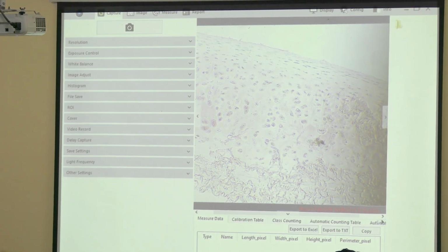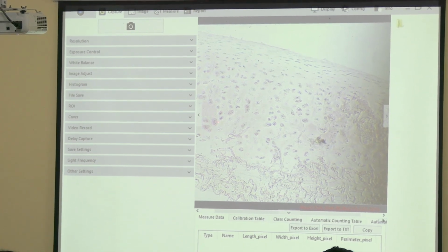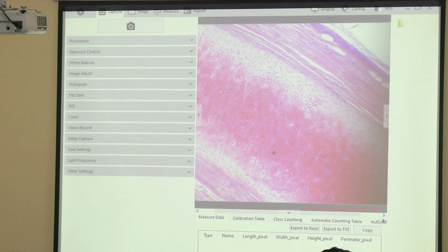And at the central position, you see the population of cells is more and bigger than at the periphery. Here you see the cells are bigger and the population is more than the periphery, right? And the intercellular substance is transparent. Here it is not actually bluish in color, but in a good slide you will get bluish color. The intercellular substance will take hematoxylin stain, that is bluish in color, right? Here you see the cartilage cells.